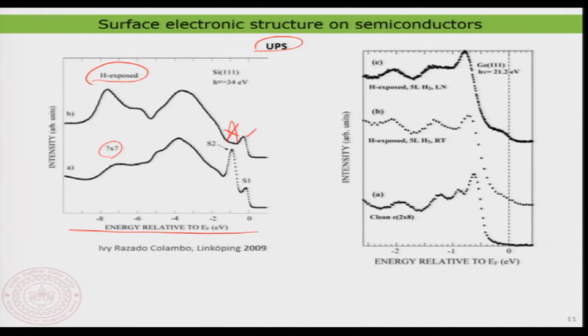This is clearly something very interesting. Now, you can use this kind of spectroscopy to look at the surface and understand what kind of chemical change has gone on, and where specifically it has happened. Of course, our understanding is better now because we have used scanning tunneling spectroscopy and photoelectron spectroscopy to clearly differentiate where S2 and S1 are coming from.